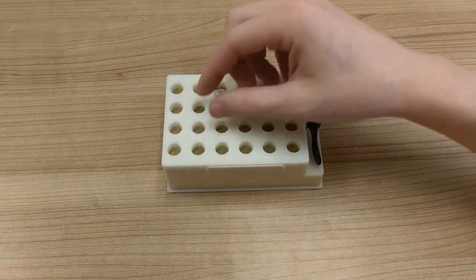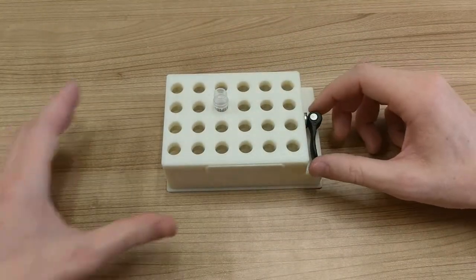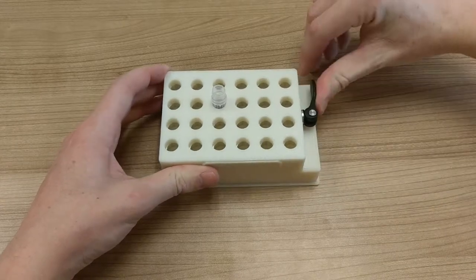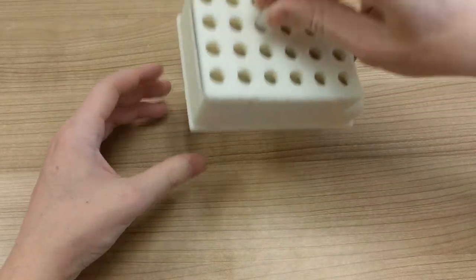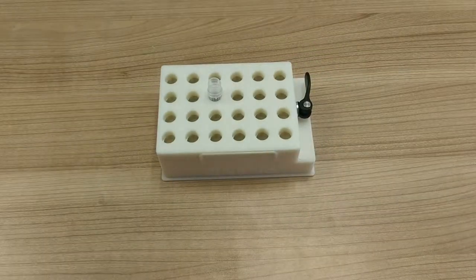Simply load the rack and tighten the cam lever to secure the tubes in place. The cam lever pulls an aluminum slider about 1mm, applying a shear force to the tube that prevents movement. Since the slider is aluminum, it has high strength and durability to resist wear damage from repeated use.